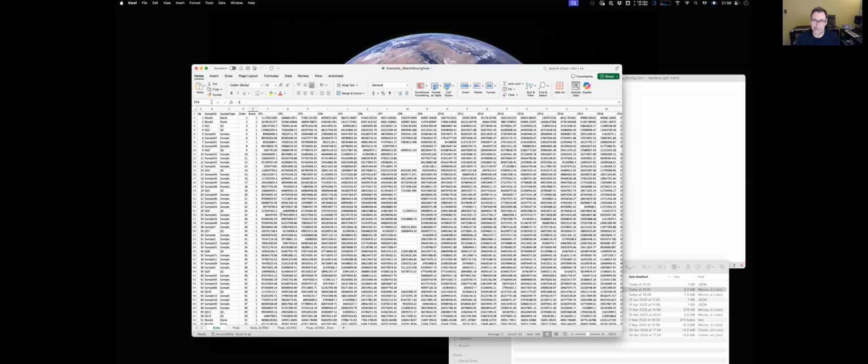So a smaller study is a lot easier because you're less likely to have that drift through the column dirtying up. And you don't have the problem of between batch, which is the far bigger problem than the within batch.